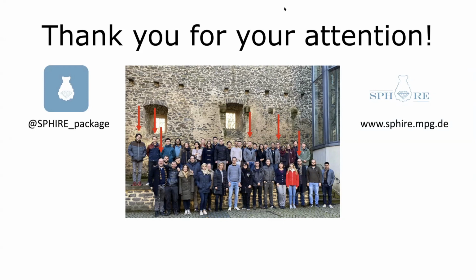Isaac is still using k-means, but it was always an equal size k-means approach, which means that you not only keep the number of classes constant, but it's actually more important to keep the number of members per class constant. In this way, it allows to identify smaller groups within a larger population and do sorting of small conformational changes as well.